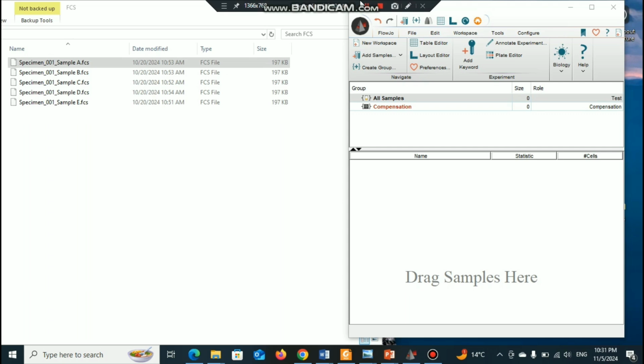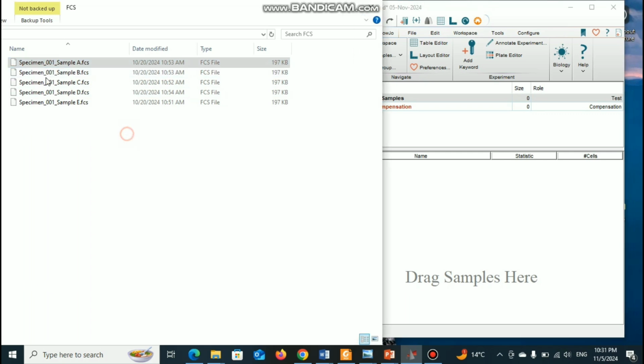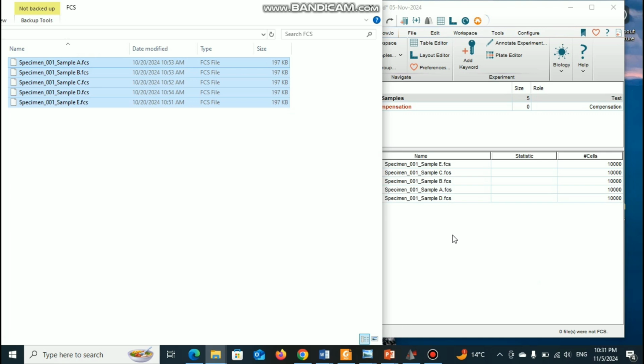In this tutorial video, I'm going to talk about how to analyze data using the FLOWJO software. So here you can see that I have some FCS files, and I have to analyze them using the FLOWJO software. So first I need to drag all of the samples into the FLOWJO window.